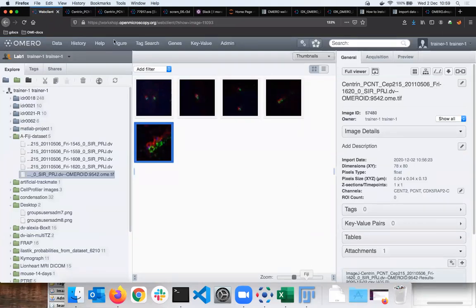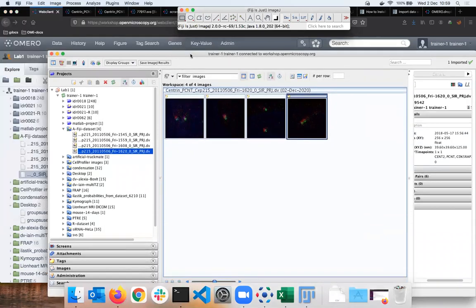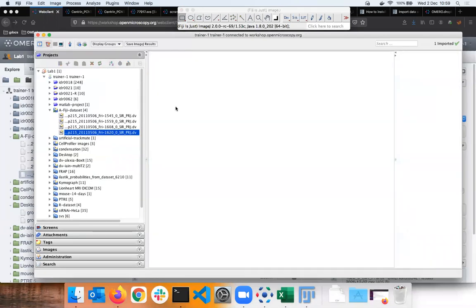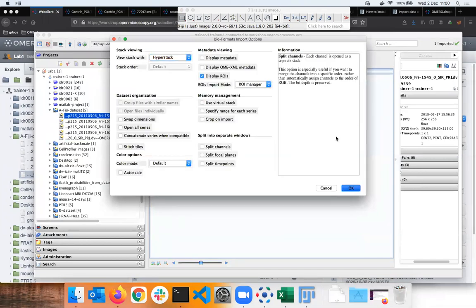And if we want to get a little bit more fancy, then we could go a step further and do something which resembles a little bit more real image analysis, such as if I, let's say, open again the first image. Then it will demonstrate for you in the first place that I can do a two-way trip with the ROIs.